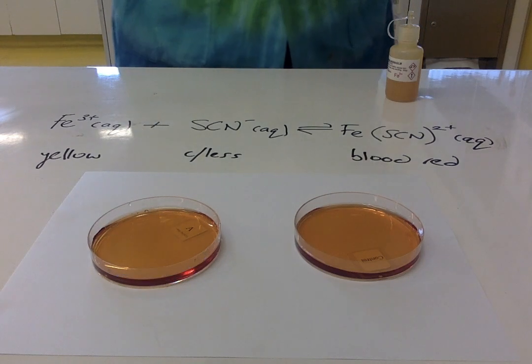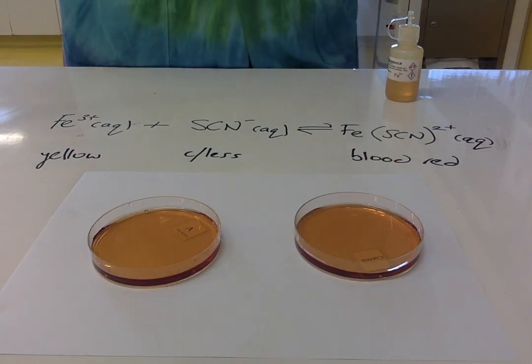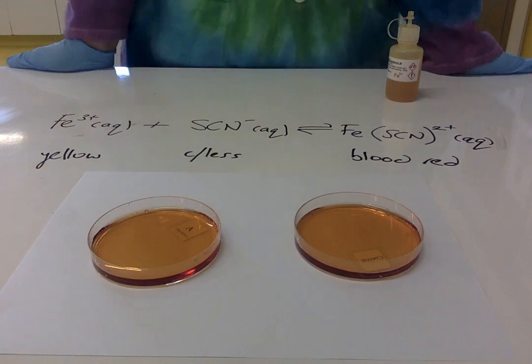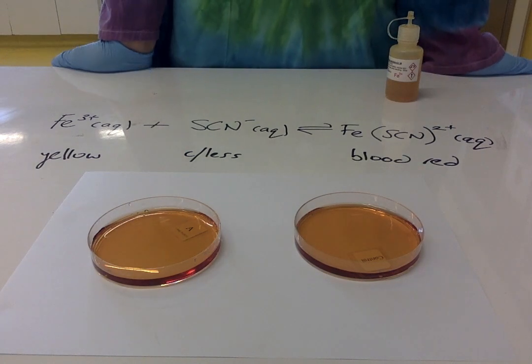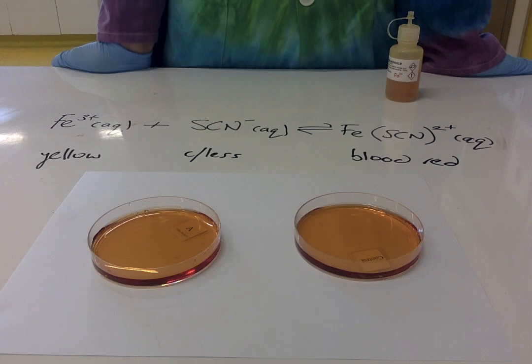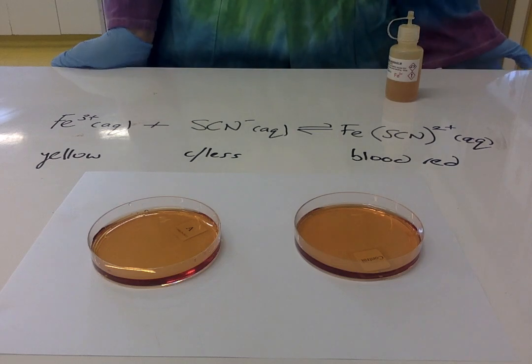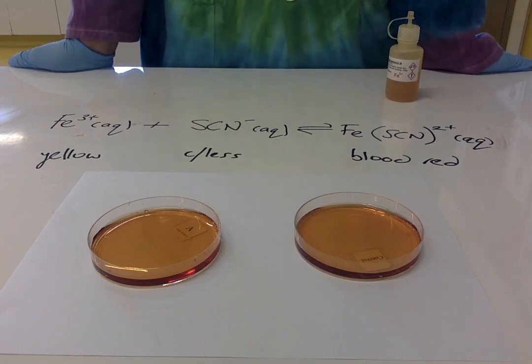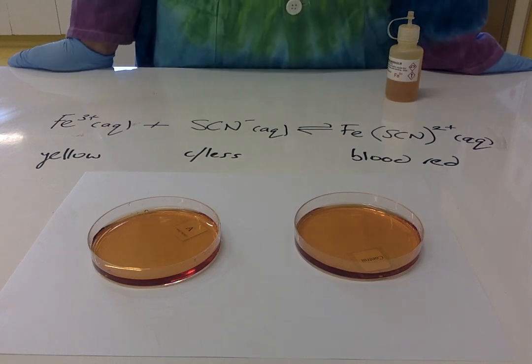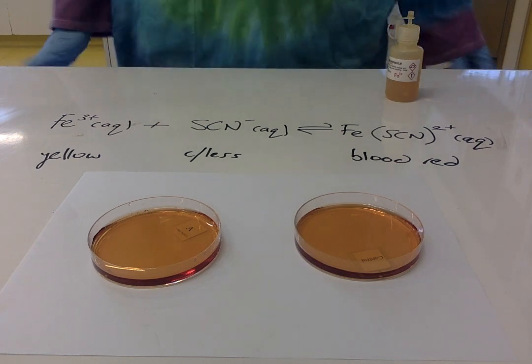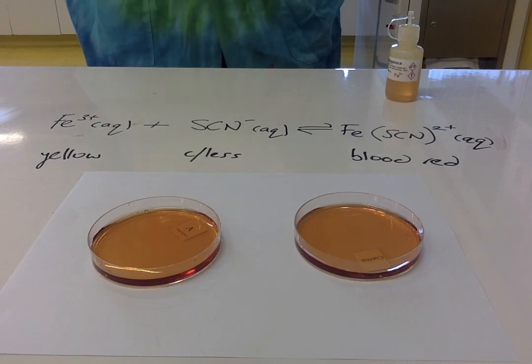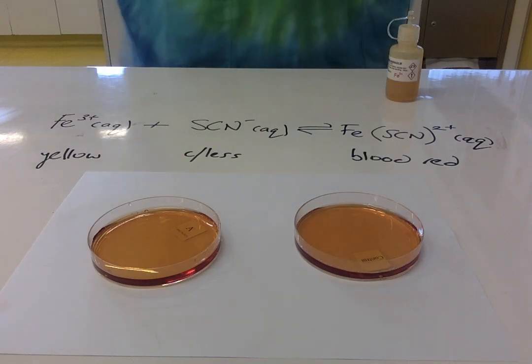What you can see in front of you is an equilibrium mixture of iron 3+ ions and thiocyanate ions making an iron thiocyanate complex. The colors of these compounds on their own: Fe3+ is yellow, thiocyanate is colorless, but the complex they make is blood red. If we get a shift to the left, the color will go lighter. If we get a shift to the right, it will become more red or darker.